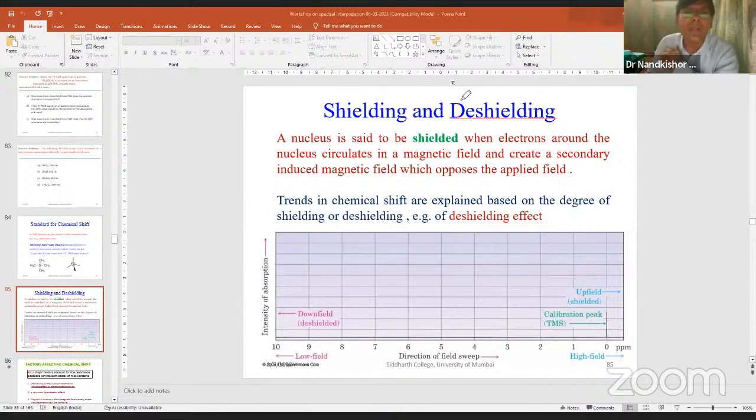Now, if you see the simple mathematical equation, what is that? If you see here, del is a ratio, with the applied magnetic field, which we have converted into the instrumental frequency. So if the denominator required is less, obviously del will be more. So the required frequency is directly proportional to the magnetic field. So what I said, the magnetic field.